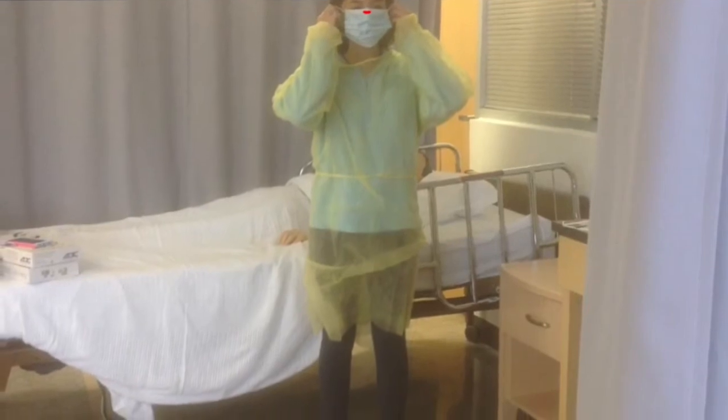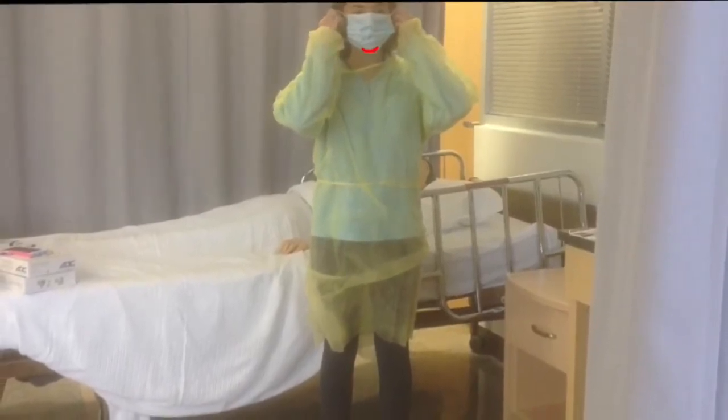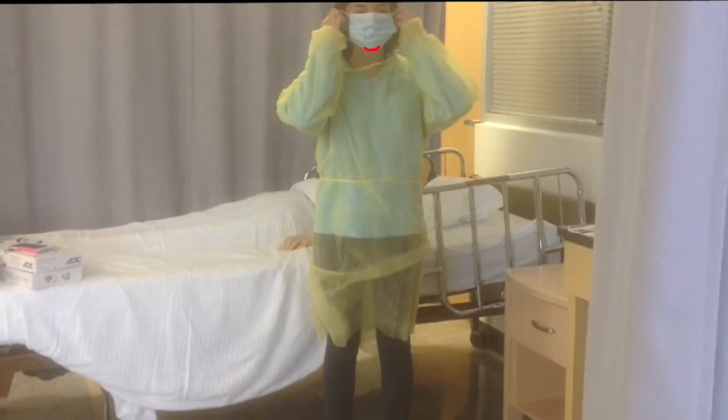Now take your mask and put it on. First, pinch the top of the bridge of the nose and then pull it down over your mouth.